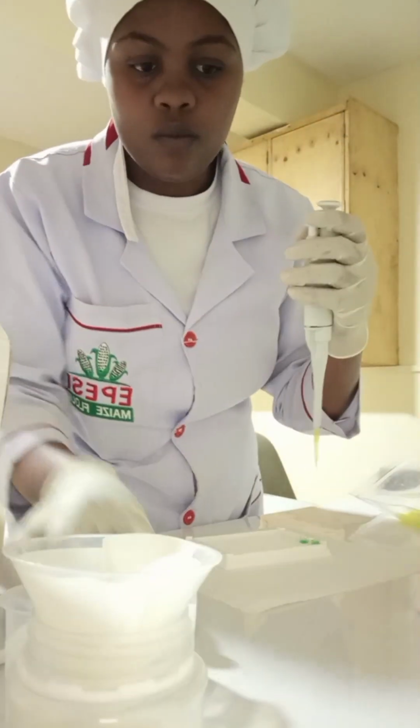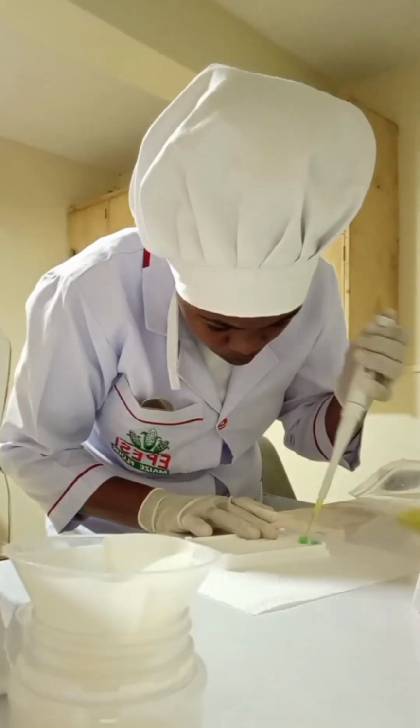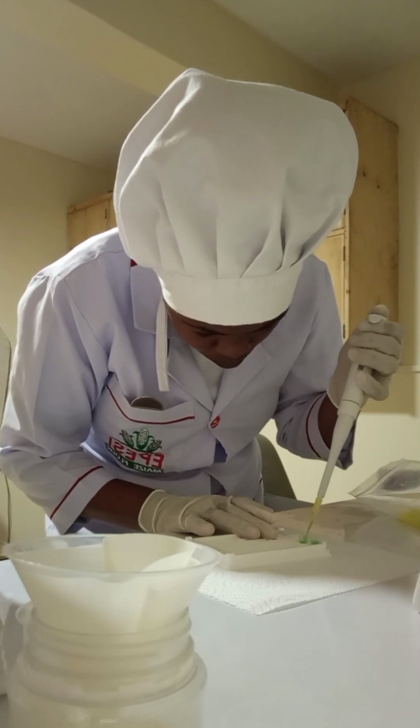It's me, I was trying to see kama bado ina record hapo. Now it's me taking another tip to pipette sample B very fast and do mixing. Mix very fast.